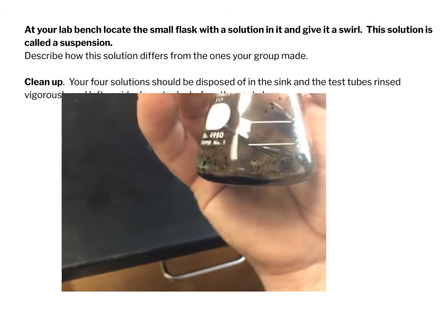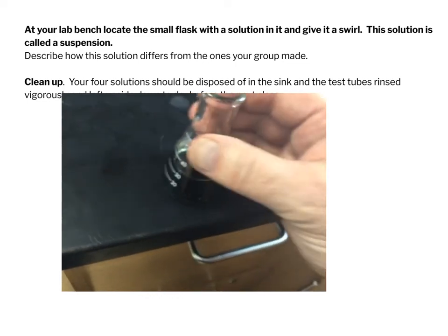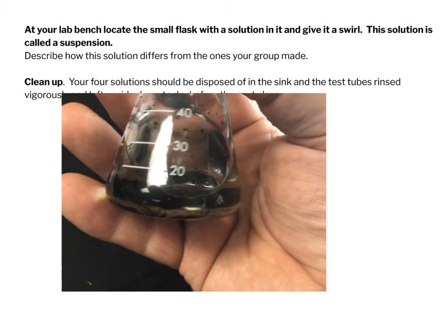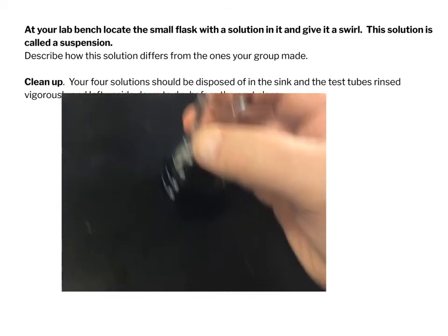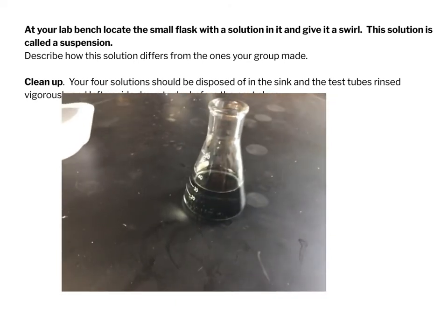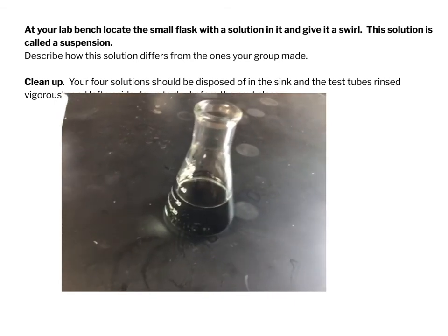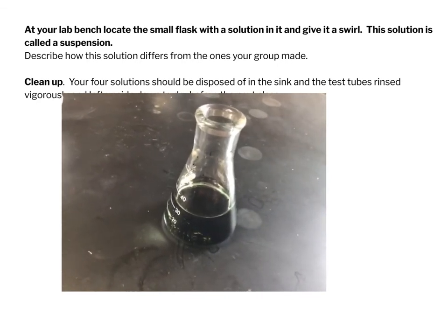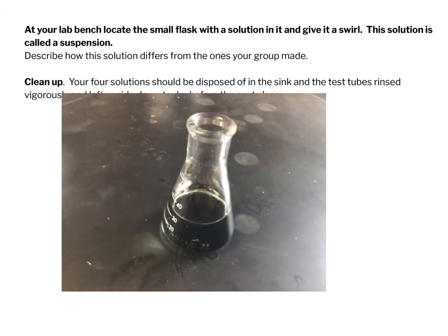It's very distinctly heterogeneous. This is a solution that we call, let's see if we get a good shot of it here, a suspension. If we let it sit for a while, that stuff will sink to the bottom and separate from the liquid, a suspension. That differs from the ones we made before, which were solutions, which were homogeneous in nature. All right, the last thing is to clean everything up, and then we're done.